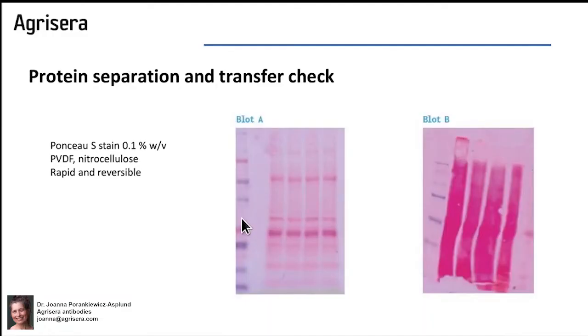Check your membrane following western blot to see the separation, how the western blot is working. You can easily check with a quick Ponceau stain, which can be applied to PVDF and nitrocellulose and is rapid and reversible.